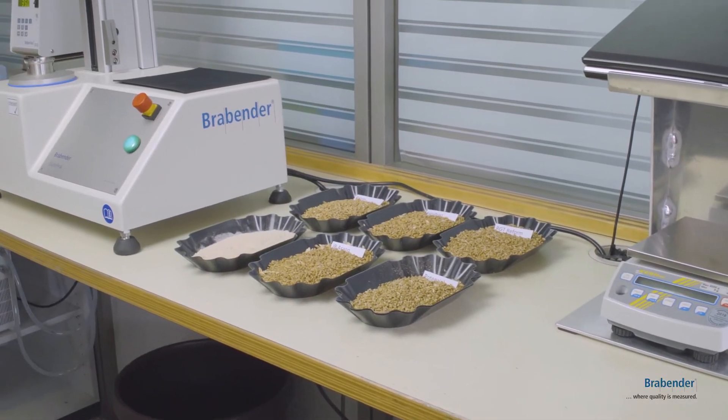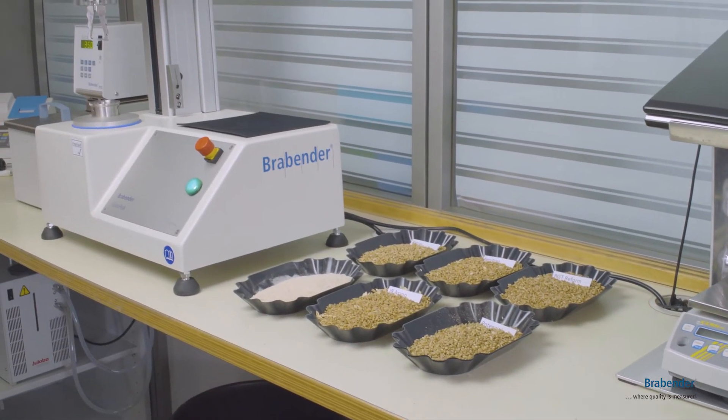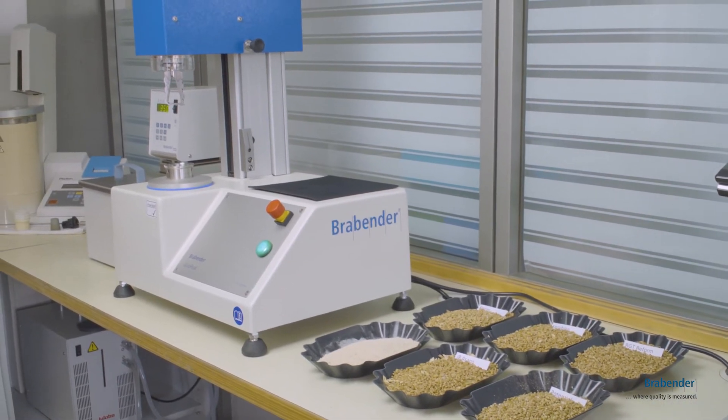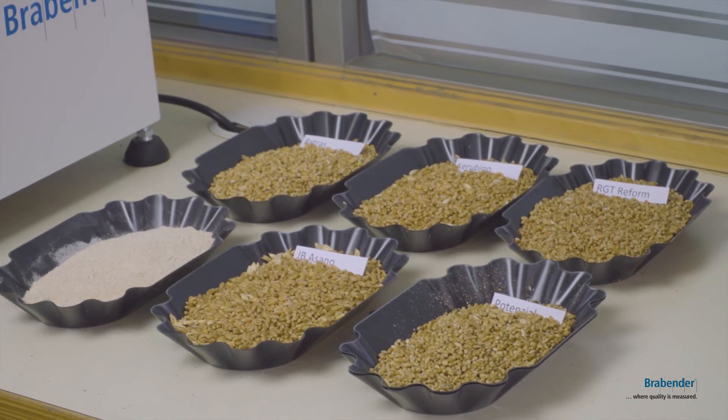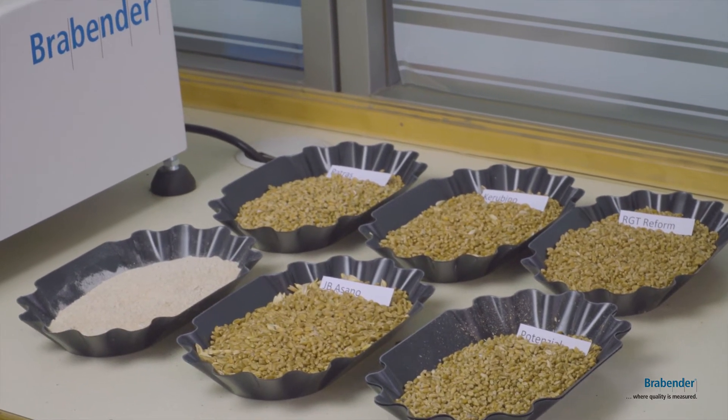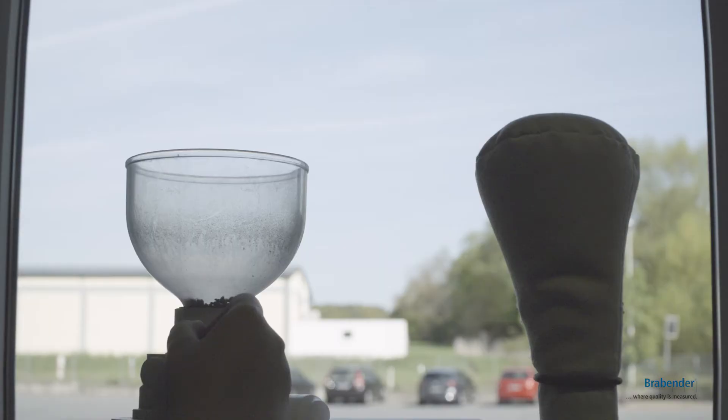The Brabender Gluto Peak has been in use in the Wiesnet Mill since the summer of 2016. It has been placed in the grain-receiving area in order to directly evaluate all delivered grains during the year, and especially during the peak season.